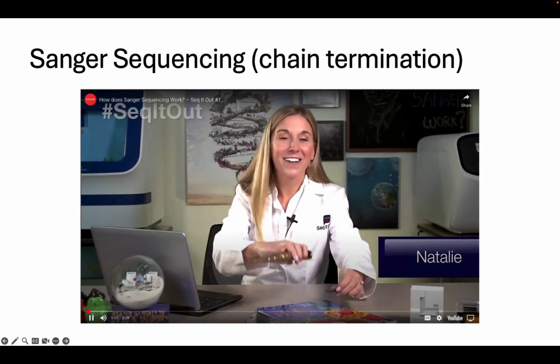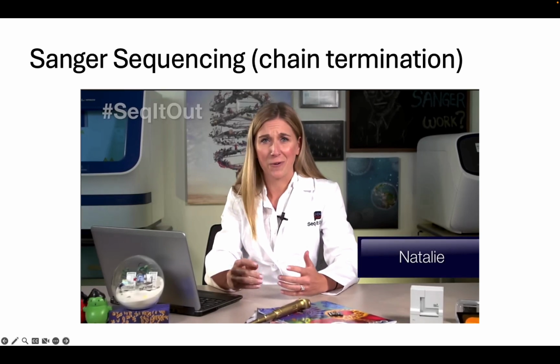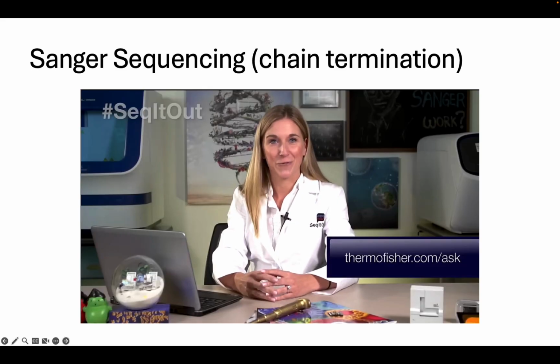Oh, hey, let's go back to the basics and explore the technology platform that has been regarded as the gold standard for many years. Yeah, you guessed it. I'm talking about Sanger sequencing by capillary electrophoresis.